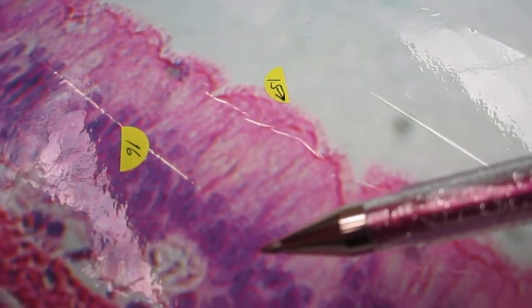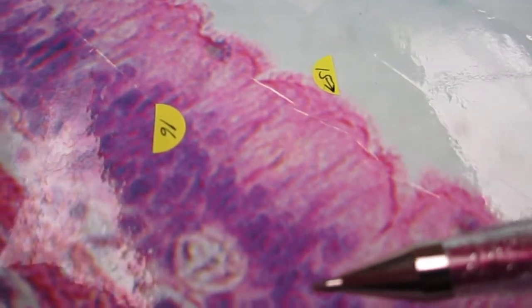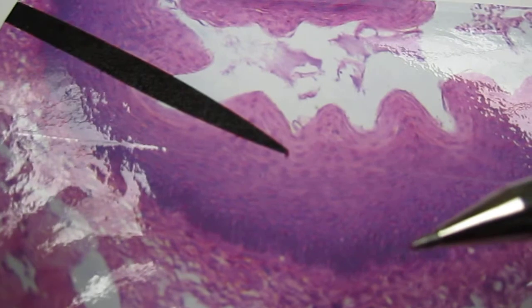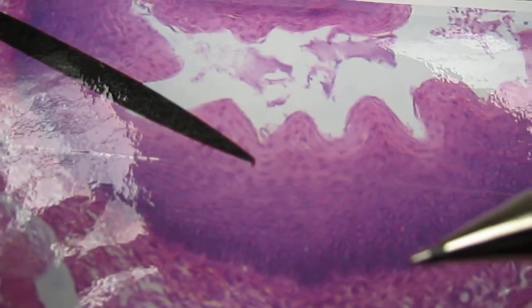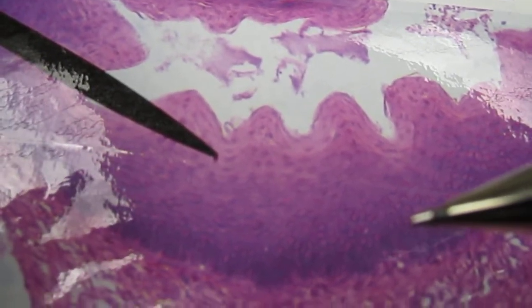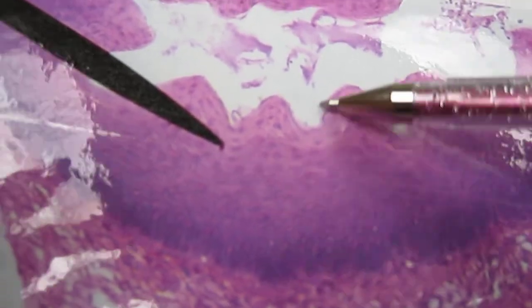So people who are put upon for various reasons, whether it's through smoking cigarettes or whether it's through working in a coal mine, and there's still a lot of people working in coal mines, that means that this tissue is going to be challenged, and very often it will make an adjustment to this tissue, which is the esophagus. Let's get our tissues in here. Here's the esophagus now. The esophagus is right next to the trachea. In fact, it's not next to laterally, but it's next to in terms of posterior to the trachea. So that means that these tissues form together, they differentiate together, they're activated together, and so consequently, when one tissue decides to go to a different tissue type through transformation, the beginning of malignancy, then this is the selection that's often made, and we have squamous cell carcinoma.